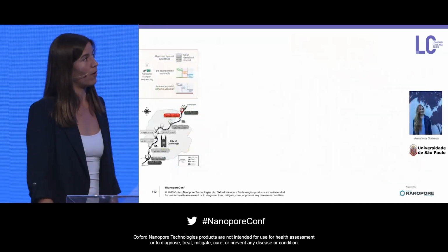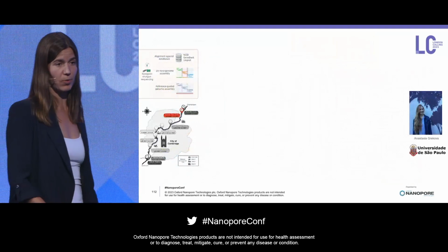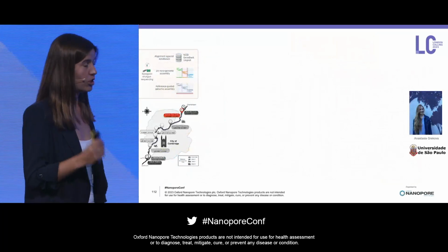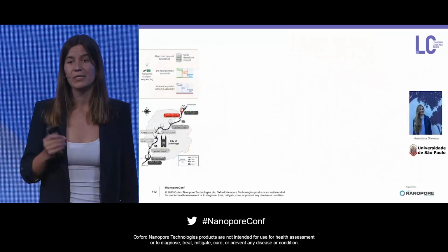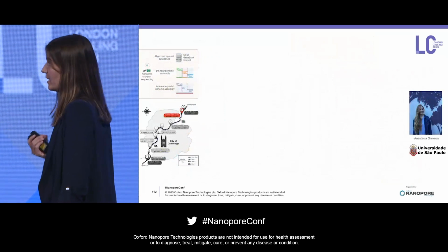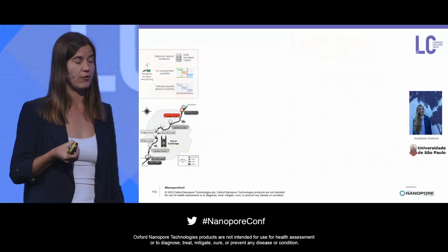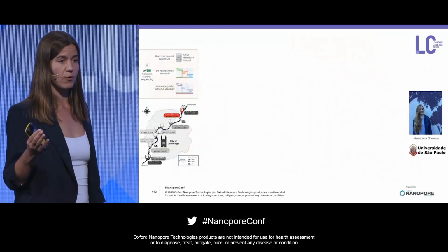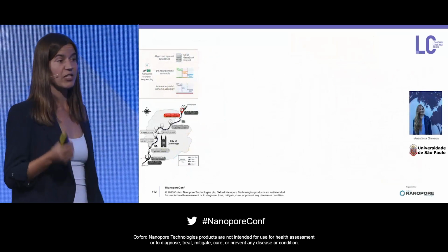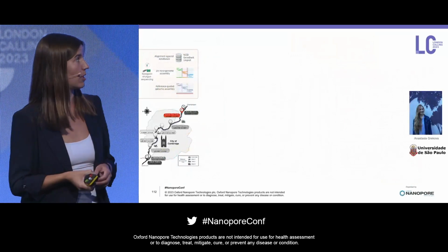So we decided to follow up on this research and actually do shotgun sequencing with nanopore, so really sequence all the genomic material in the samples. And this allows us to do de novo genome assemblies from this data, or create so-called MAGs, or metagenome-assembled genomes, that give us really high-confidence presence predictions of certain bacterial taxa, also of all sorts of other taxa, such as eukaryotes, fungi, and so on. Plus, we can do a functional annotation. We can look for biosynthetic gene clusters that tell us something about the function of these organisms.